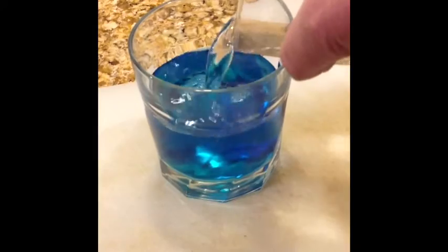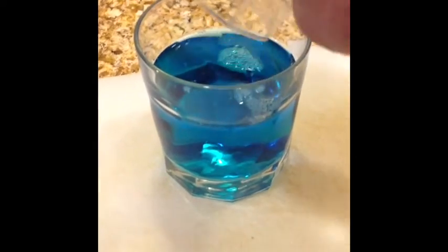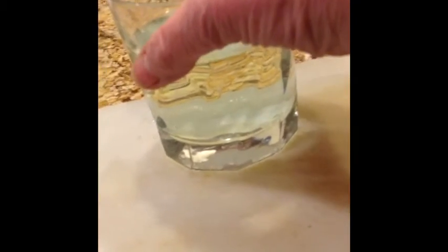However, let's see what happens. Oh yeah, there we go. Very nice. Alright, our next chemical reaction. So we have a change in color.